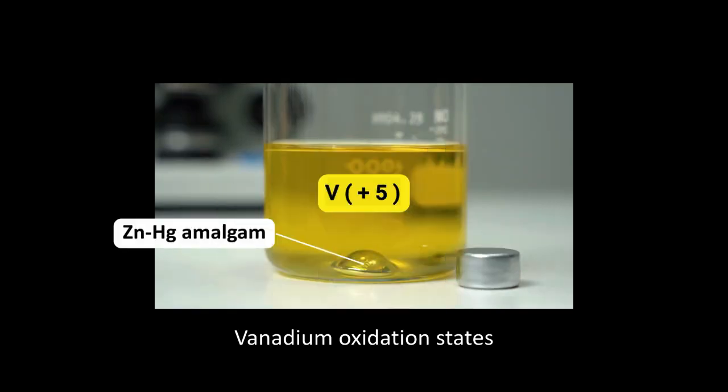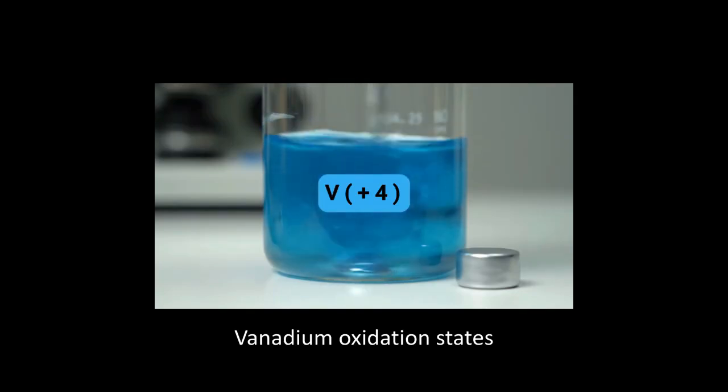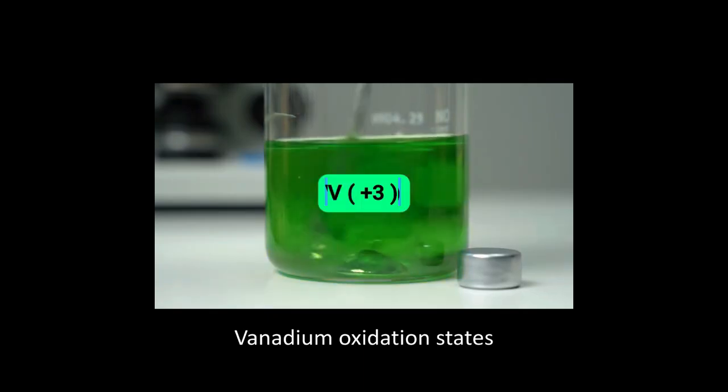Well, the zinc mercury amalgam is a mixture of metals, and metals can lose electrons. Now if I agitate this mixture, I can force some of the electrons to go from the metal to vanadium +5, thereby reducing it to vanadium +4, which is blue in color. And if I agitate it some more, I can force even more electrons, thereby reducing it to vanadium +3, which is green.